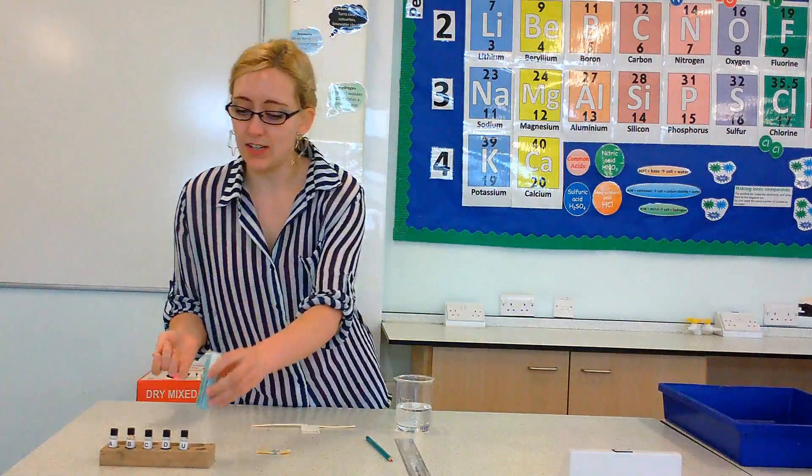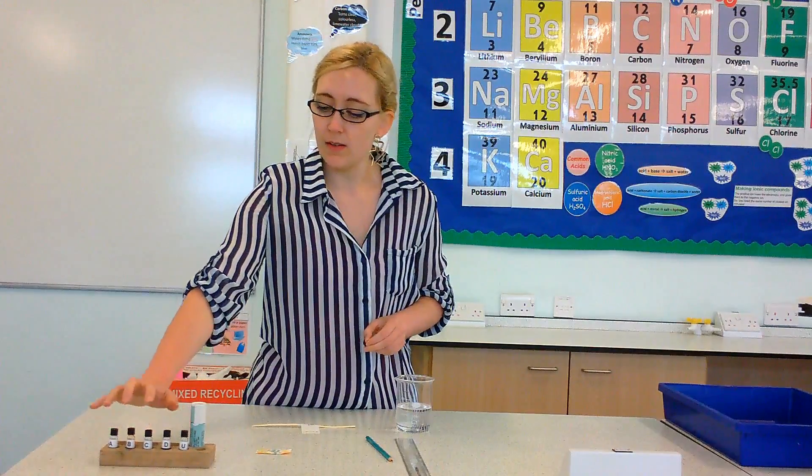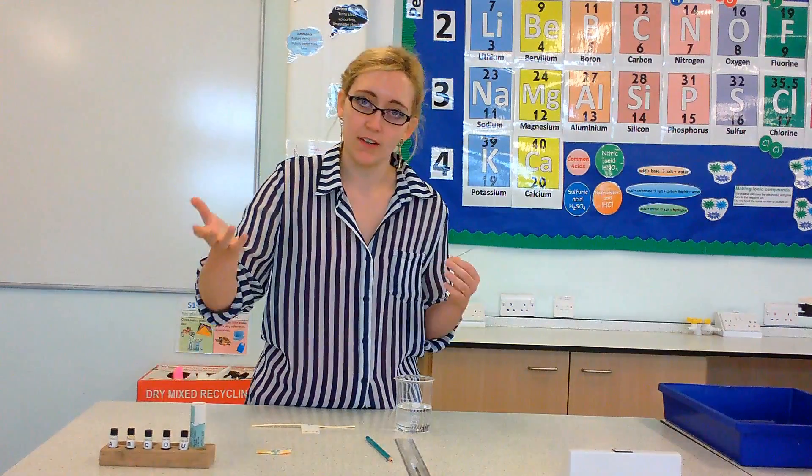You're also going to need four dyes plus an unknown dye. So I've just got dye A, B, C, D and then U which stands for unknown.